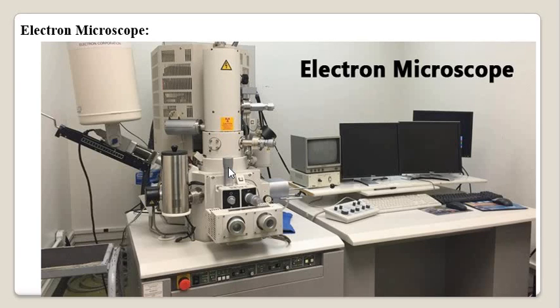The number of electromagnetic lenses, the screen and photographic plate, means this tube is not free. Whatever attachments are there to this tube, it is going to hold all together, and these parts are aligned one above the other. Means a mechanical system: electron gun, magnifying lenses, the coils, they are aligned one above the other. And the microscope column provides a protective shield to the operator from X-rays that are generated when electrons strike the metal surface.